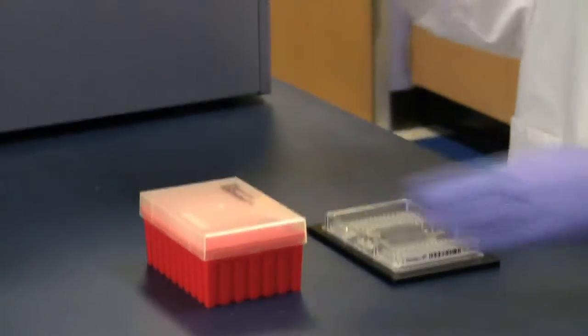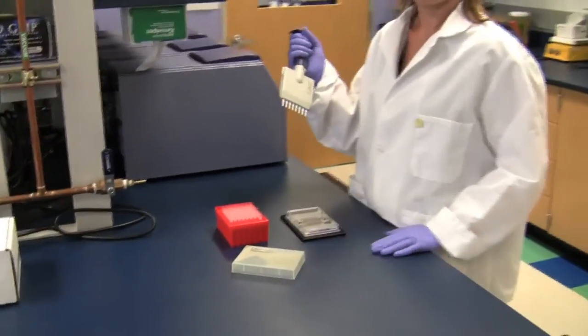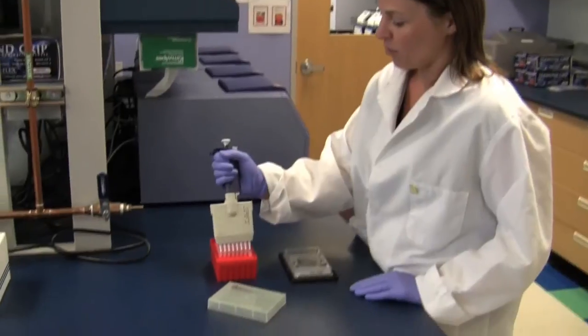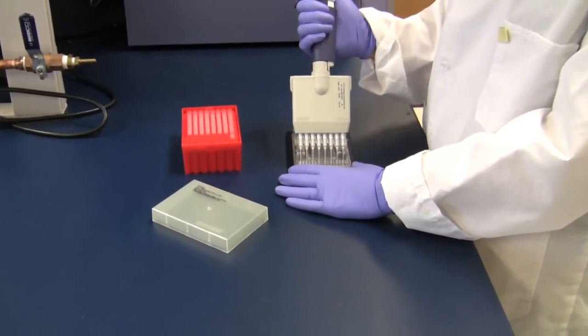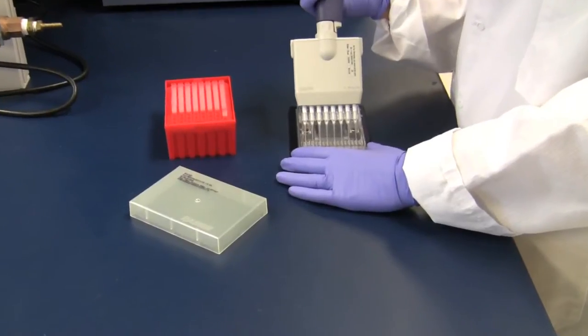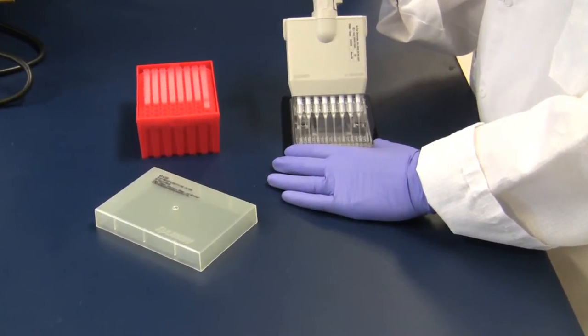Basically it's as simple as taking an 8-channel multipipetter and we're going to load our assays on the left-hand side of the chip in each one of the corresponding inlets. And there are 12 columns of inlets.